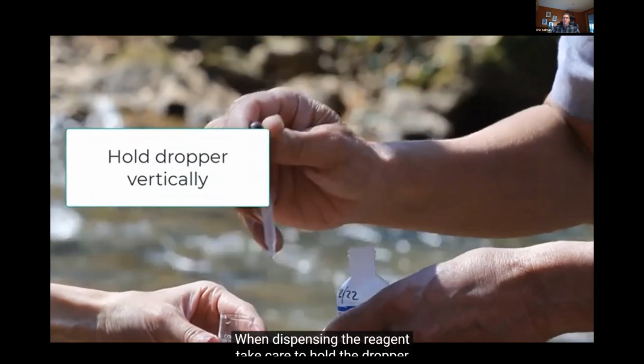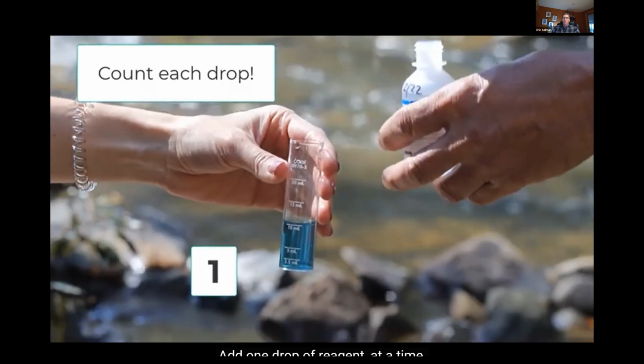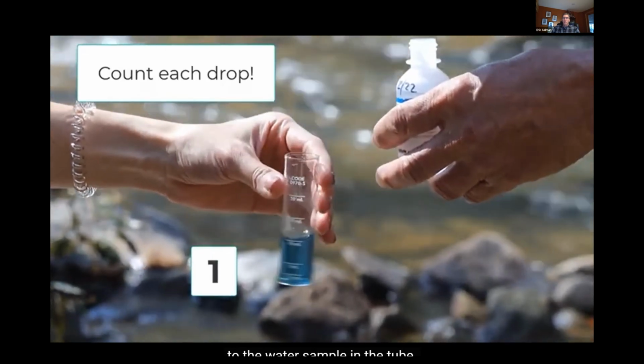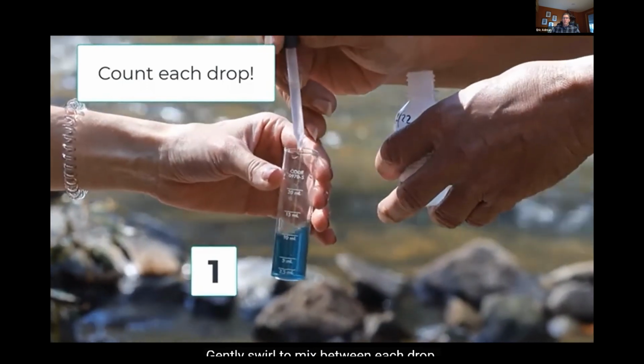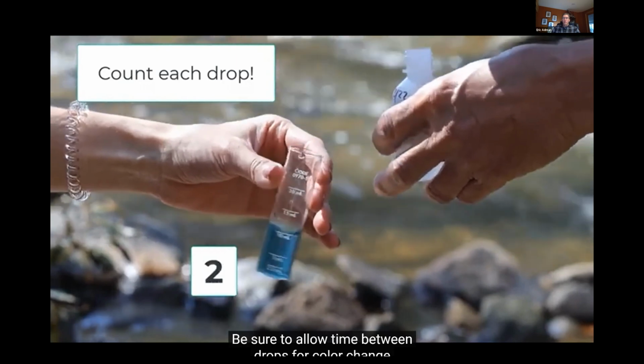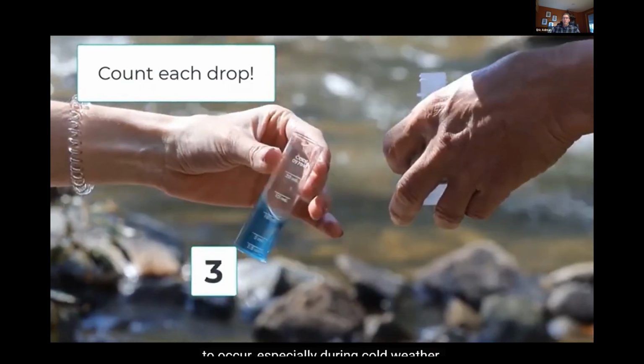When dispensing the reagent, take care to hold the dropper vertically. This ensures uniform size drops. Add 1 drop of reagent at a time to the water sample in the tube. Gently swirl to mix between each drop. Be sure to allow time between drops for color change to occur, especially during cold weather.